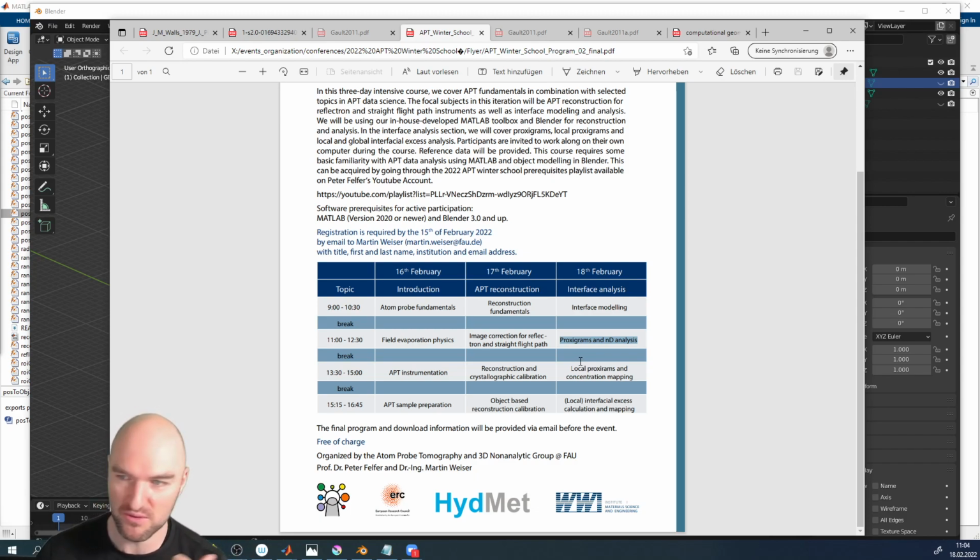It doesn't matter if you use the grain boundary model we just had, an isosurface, point objects, or line objects, it will always be the same. We'll also look into how we can do ND analysis. Okay, let's get right into it.